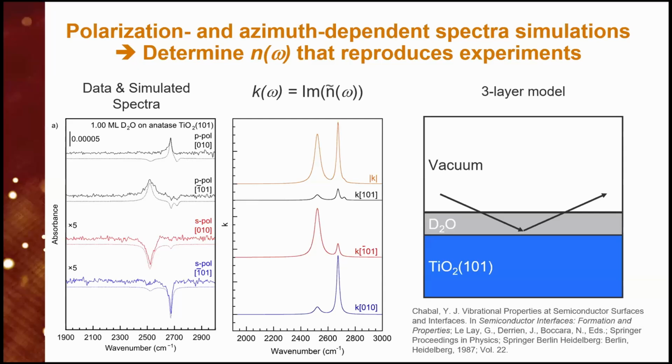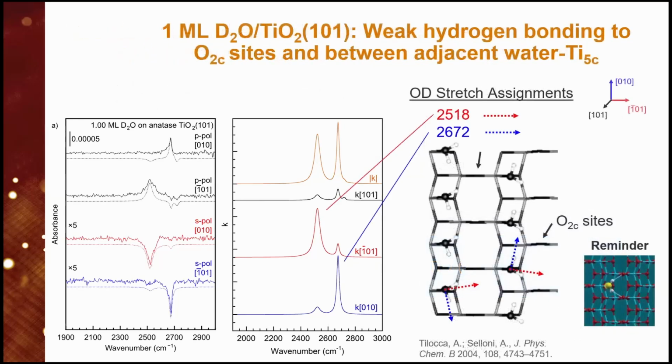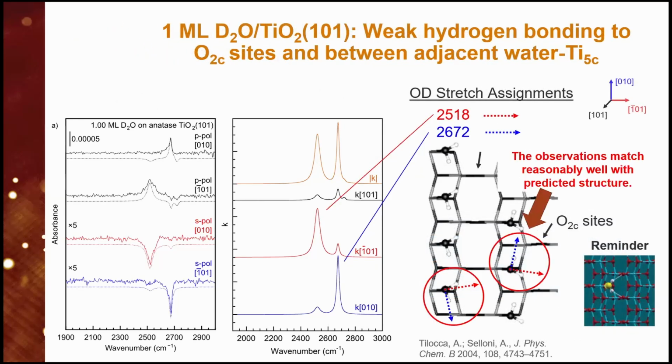From this, now we have the K vector with 3 components: along the surface in one direction, along the surface in the other direction, and normal to the surface. So we can reconstruct the vector for the transition dipole moment that gives these things. And so now if I take in the plane the ratio of those, that gives me the angles, right? So my postdoc Chris O'Connor, who did this data, realized he could do that, did those calculations, and these lines here are his calculations of those angles. It's not very bad, right? It kind of tells you what's going on there.